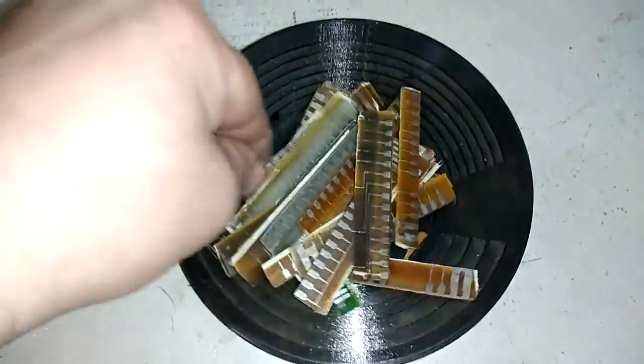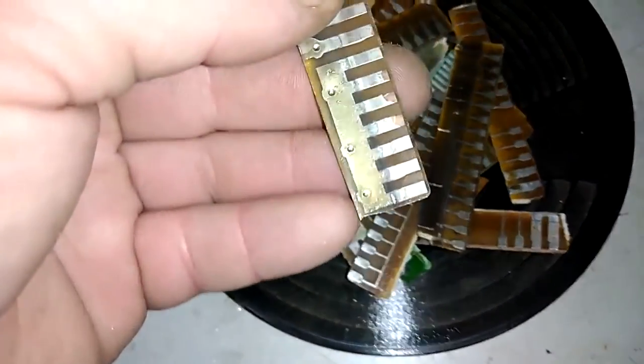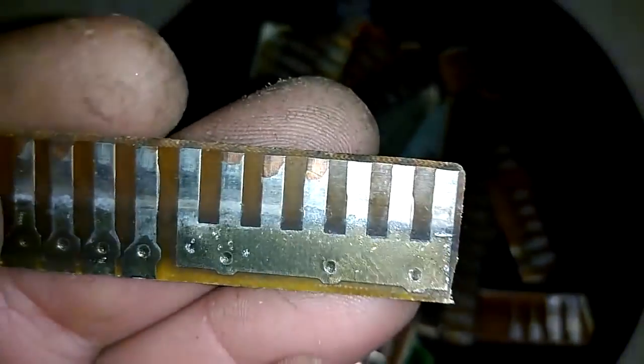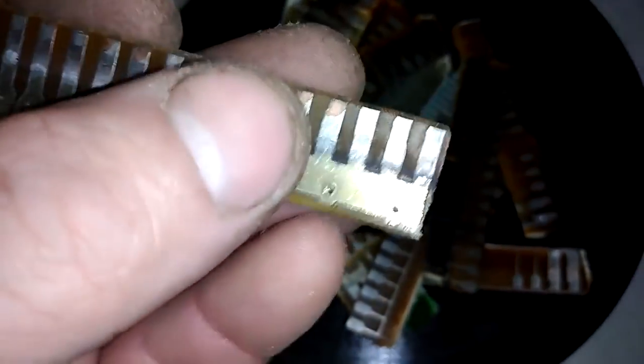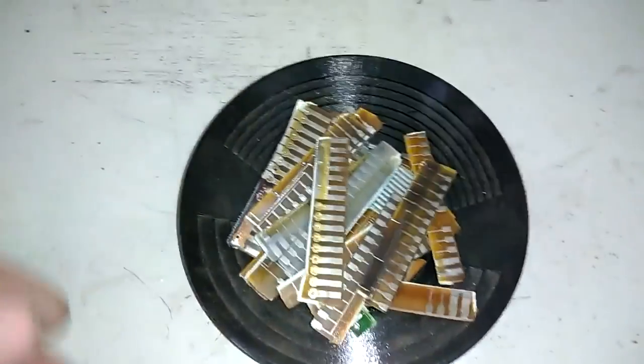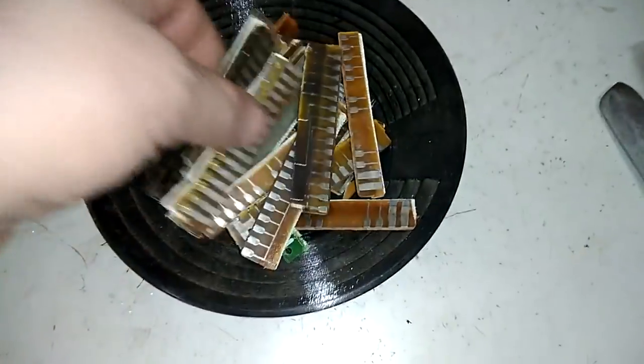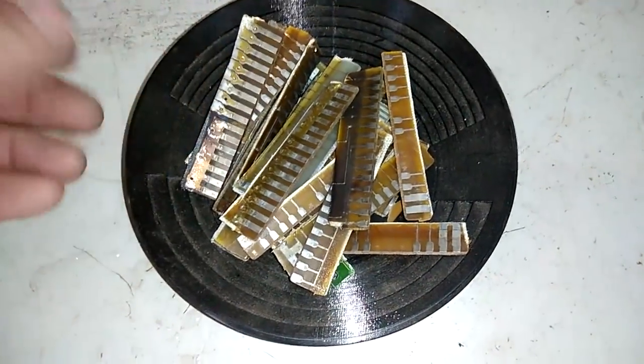So what I'm gonna do, I'm gonna use AP solution of course. I start to use a lot of AP solution lately because I don't want to spend too much nitric acid, sulfuric acid, or other types of acid. You see, it's copper silver underneath — it's just very nice palladium foils there. So I tested that, it's not silver, it's palladium, I already tested that.